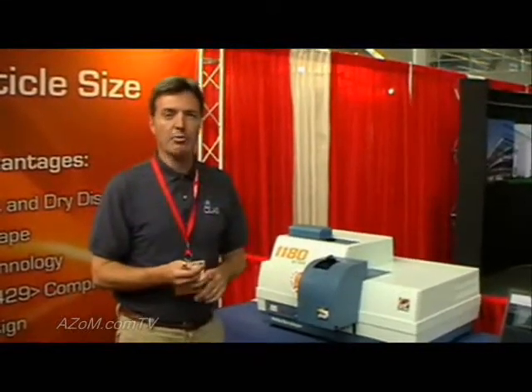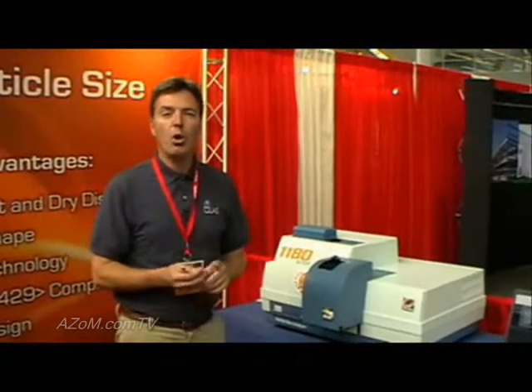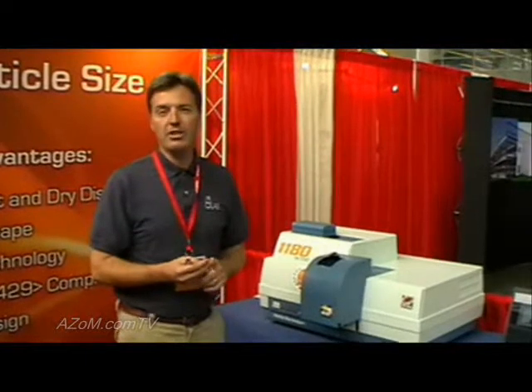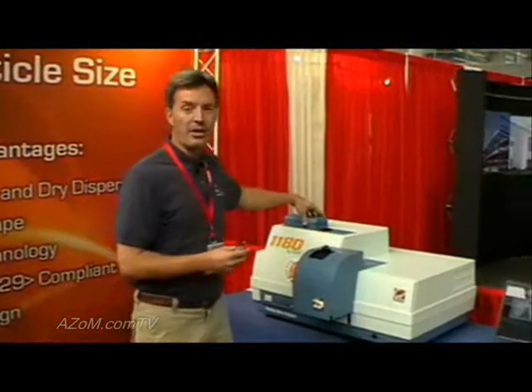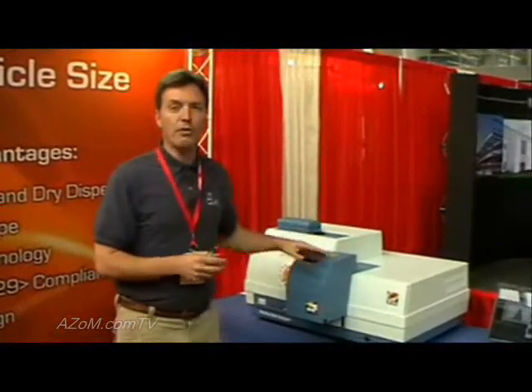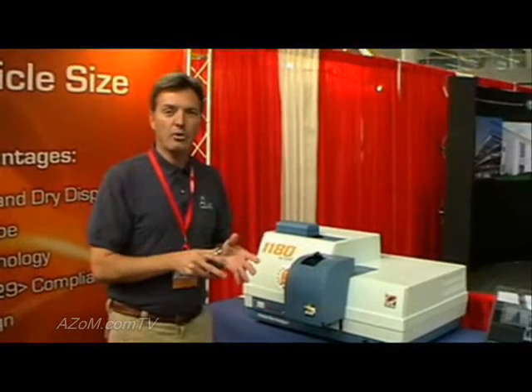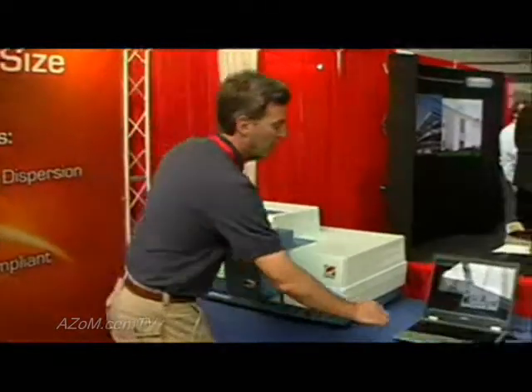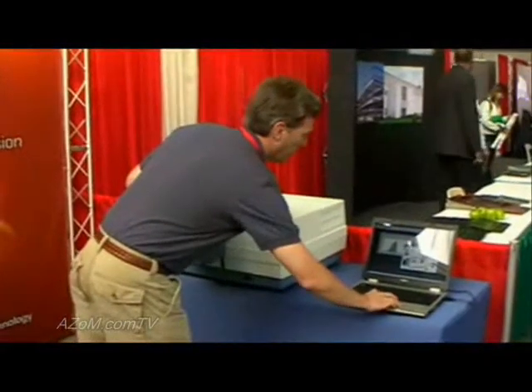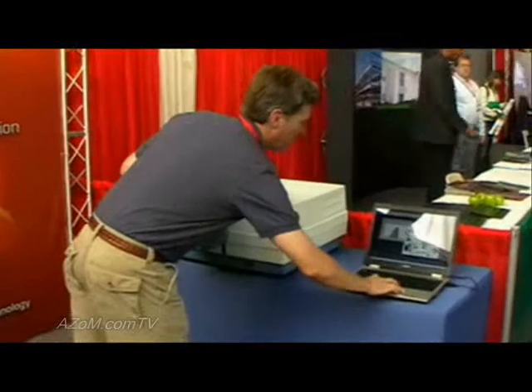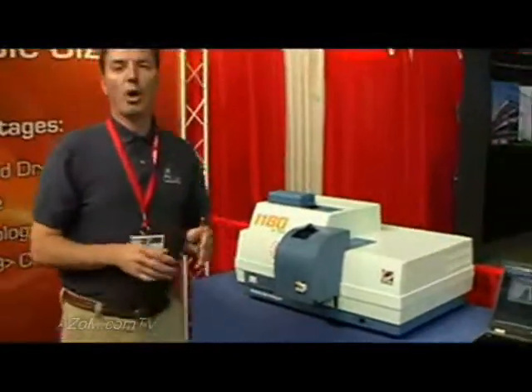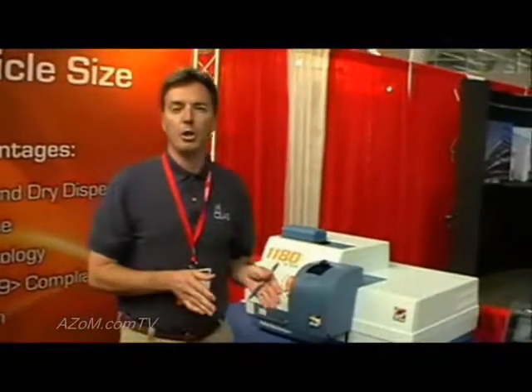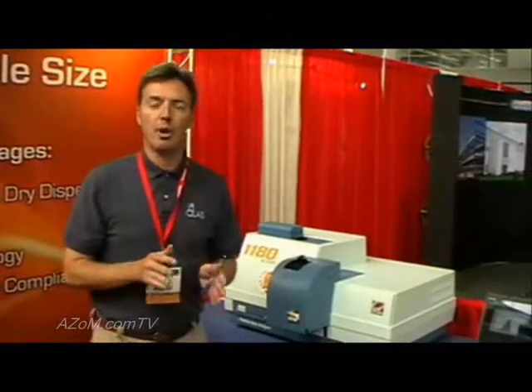The 1180 can analyze samples both with a wet dispersion and a dry dispersion. What's unique to Silas is that both the wet and dry dispersion are fully integrated. A customer can switch from wet to dry dispersion simply by clicking one button in the software — from wet dispersion to dry dispersion — with no alignment or revalidation required to switch between modes.